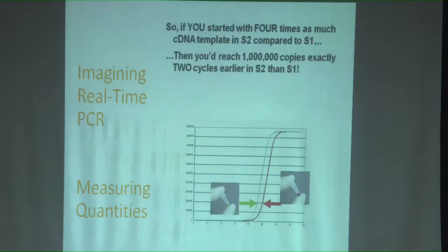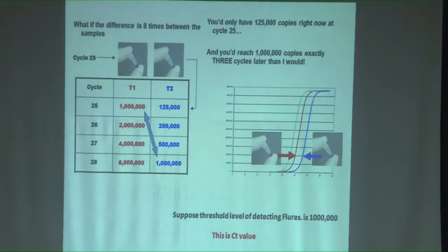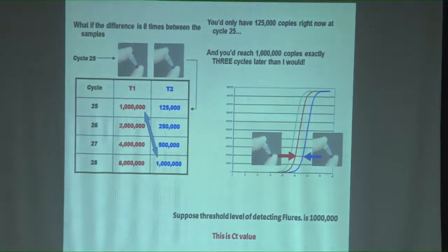Now our job is this. Look here, two samples. As I said to you, in one case you have reached the threshold earlier, and in another case 2 cycles later, right? Now this difference, whatever is coming in terms of CT value, you have to convert in terms of fold difference. That's a calculation by formula.